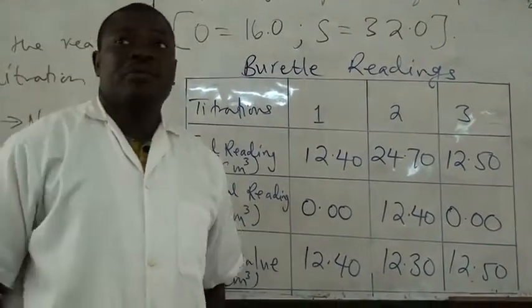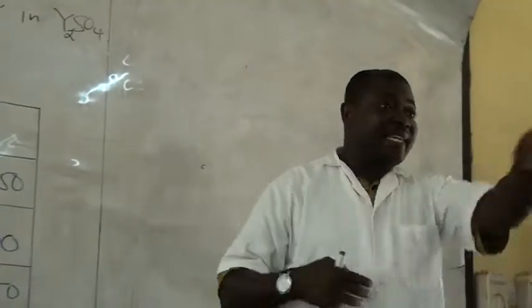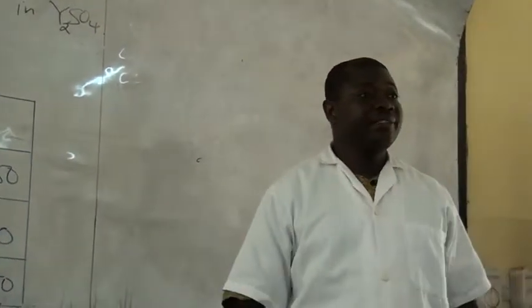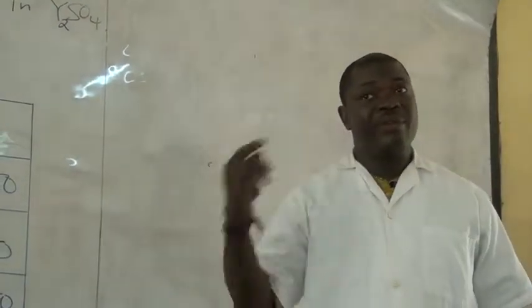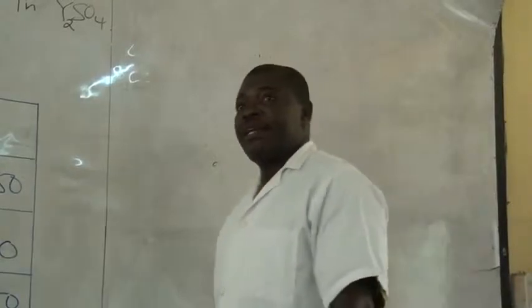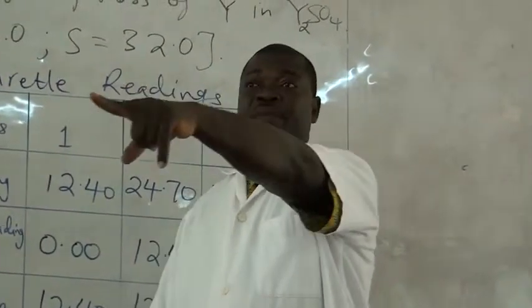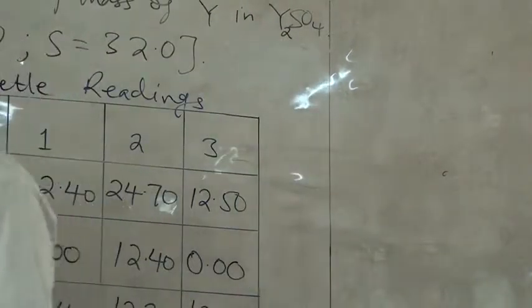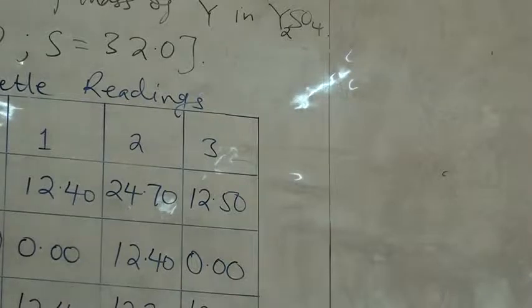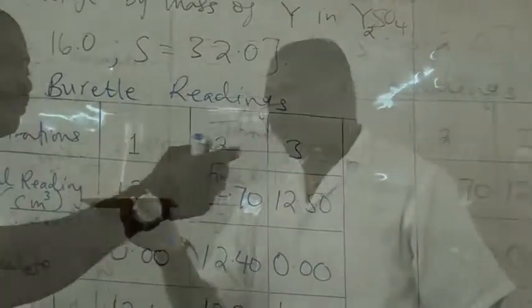You should also do it to get consistent titers. I think that color change is a very nice color change. Yeah, that's the orange color. This one, you still have some yellow color in there. But you can show it to your friends. That color, gentlemen, this is orange.